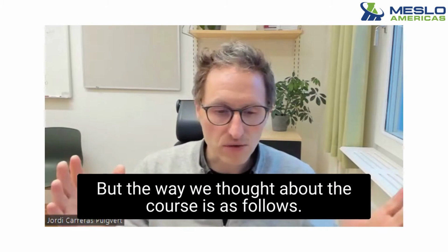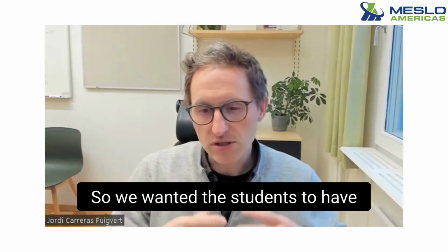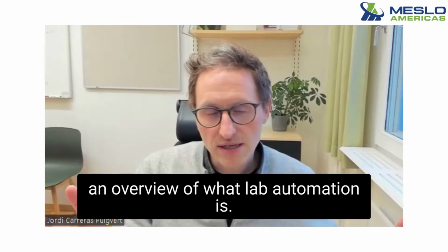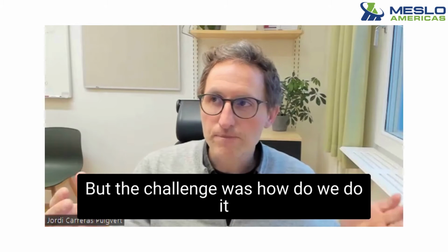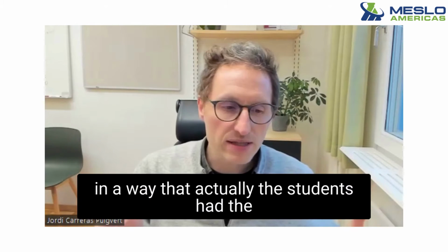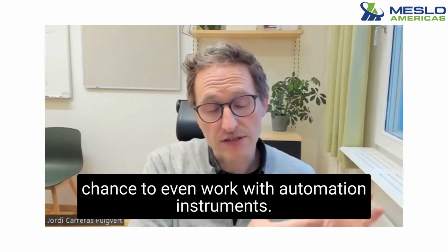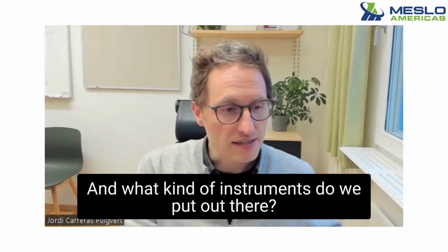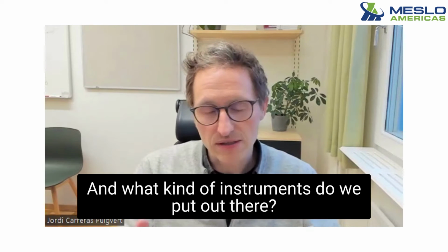But the way that we thought about the course is as follows. So we wanted the students to have an overview of what lab automation is, but the challenge was, how do we do it in a way that the students have the chance to even work with lab automation instruments, and what kind of instruments do we put out there?